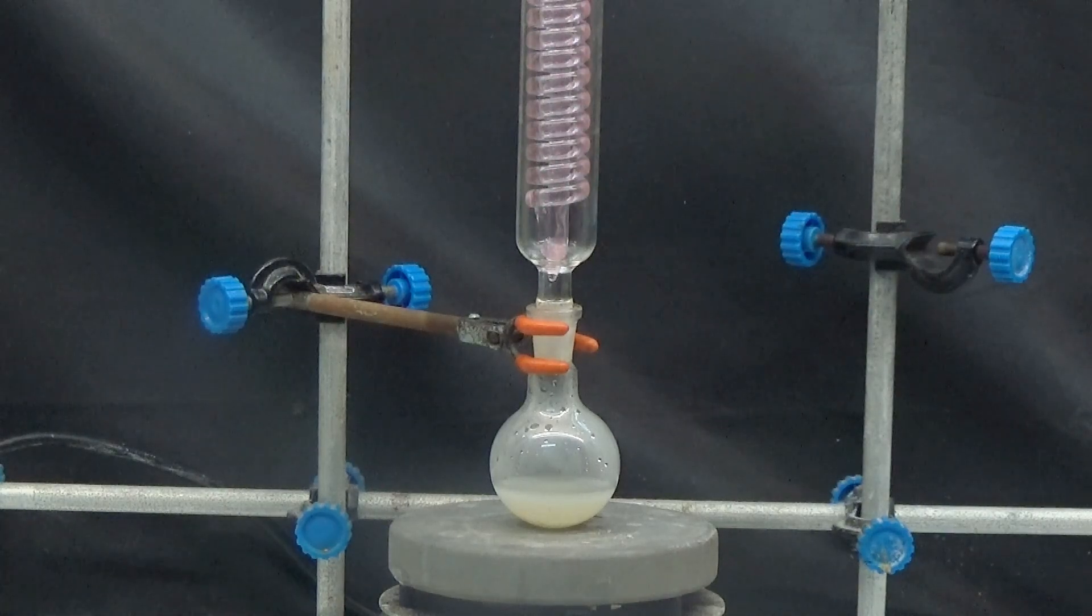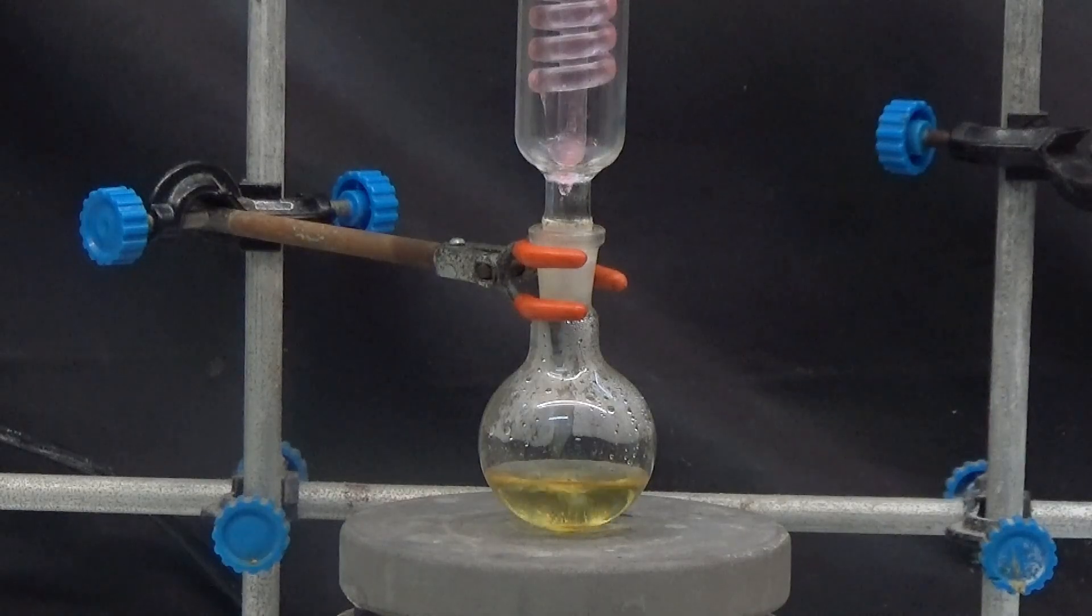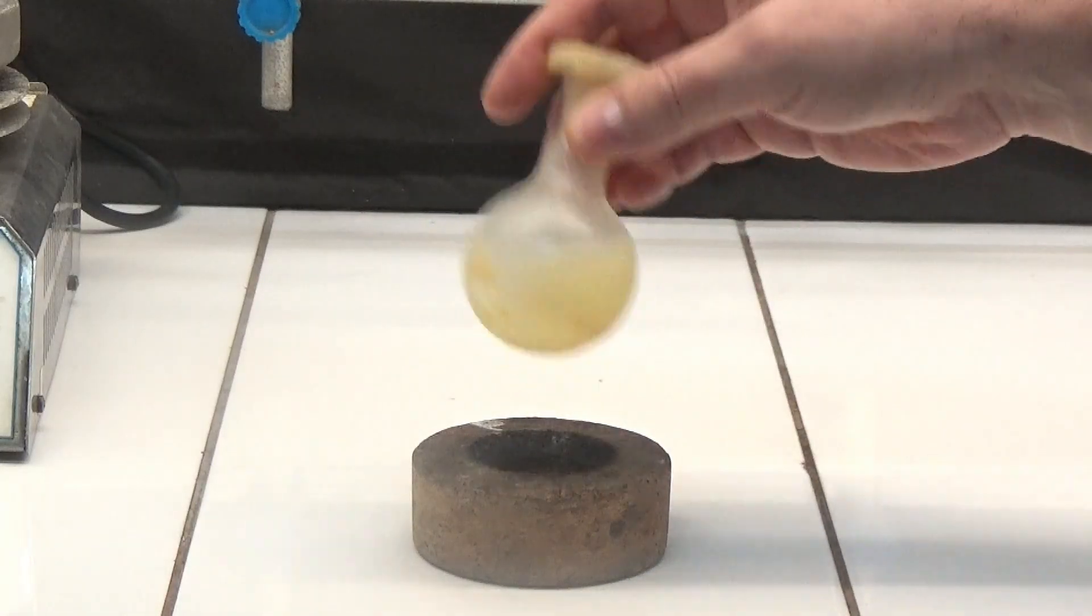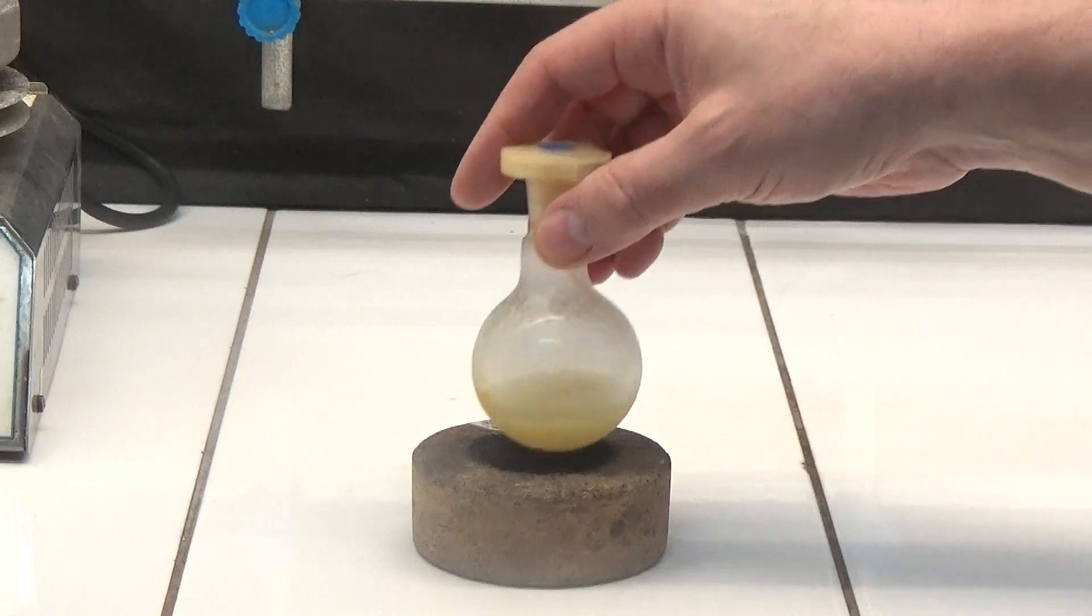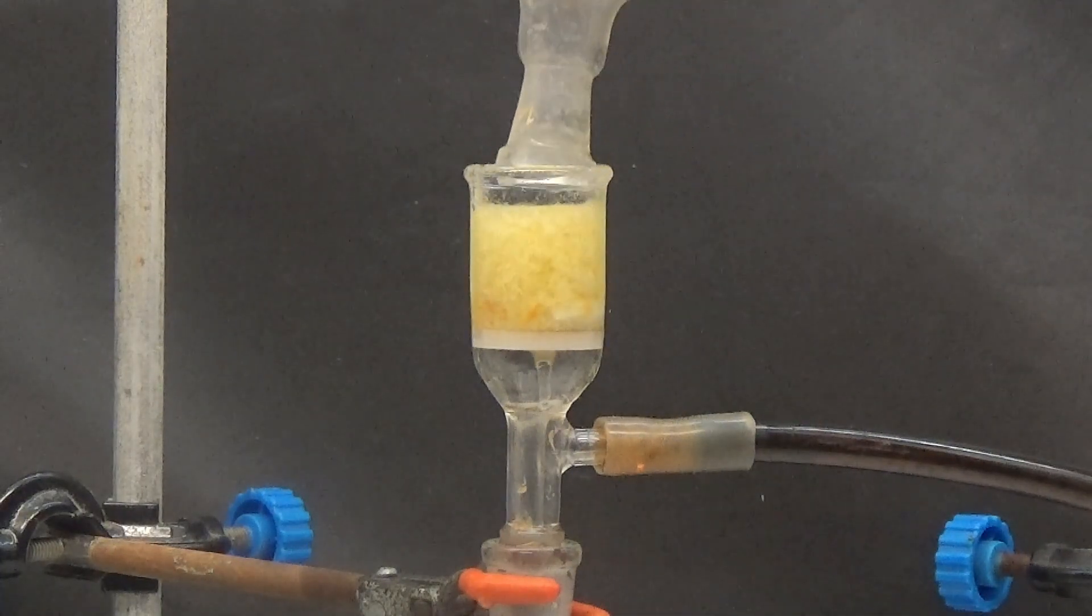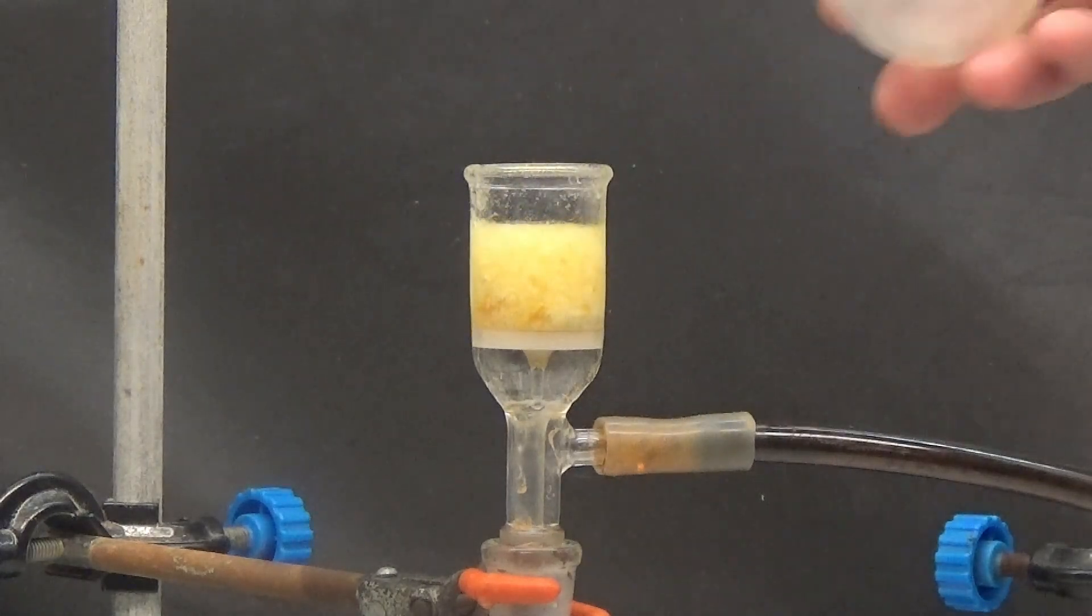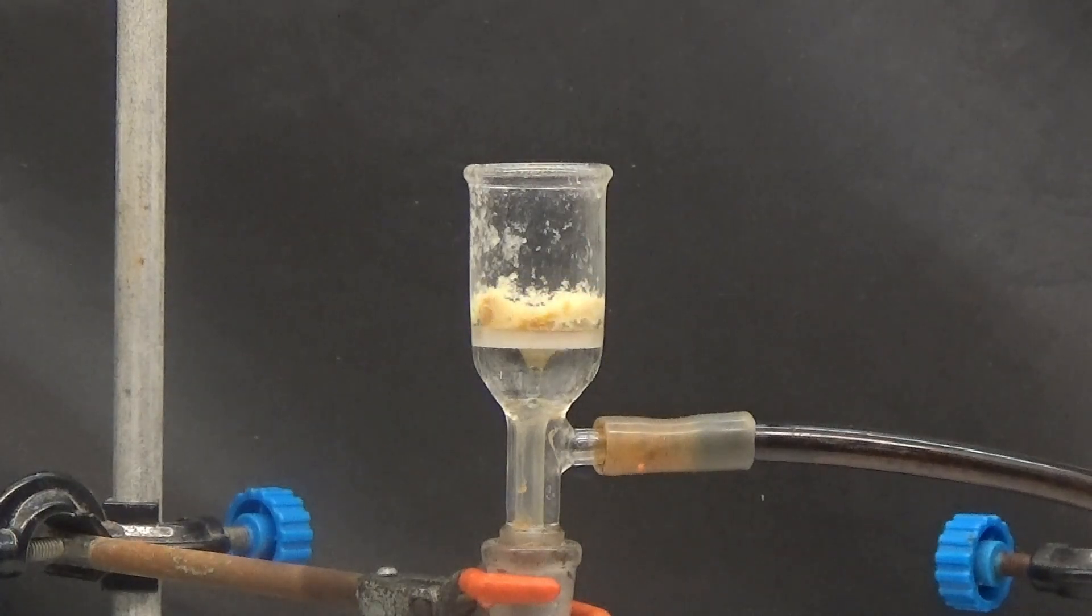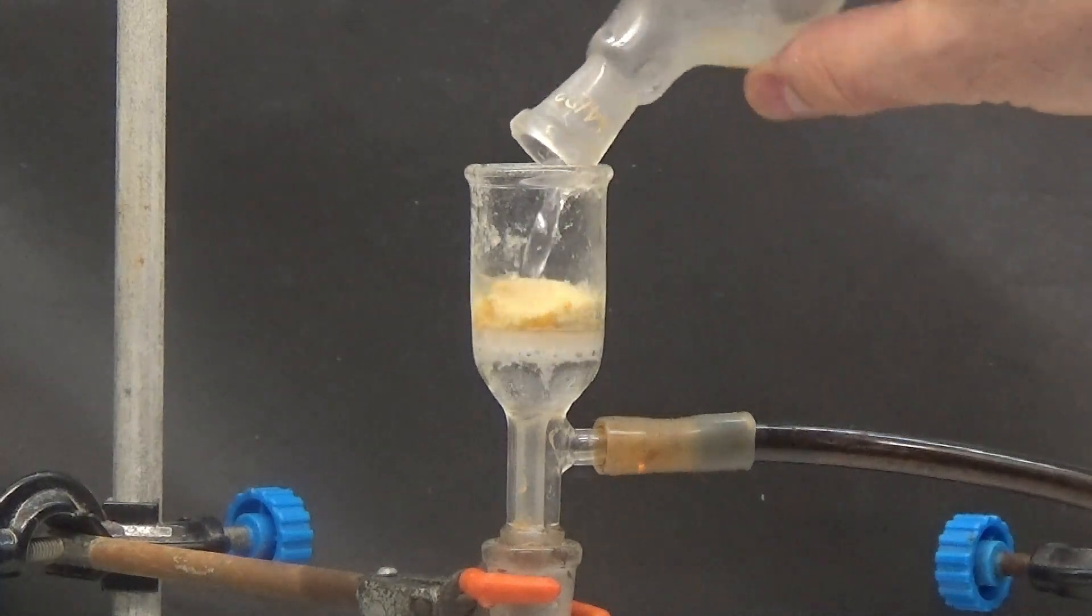Heat to reflux for 45 minutes and let cool for 1 day in the refrigerator at 0 degrees. Collect the crystals obtained by suction and wash with a little cold water. Allow to dry in the funnel by suction.